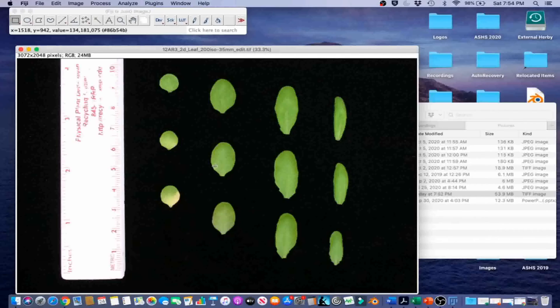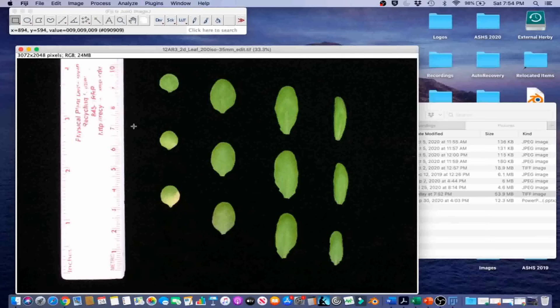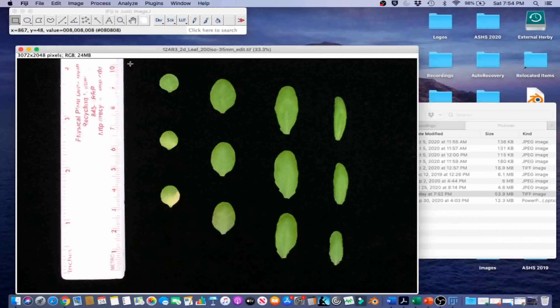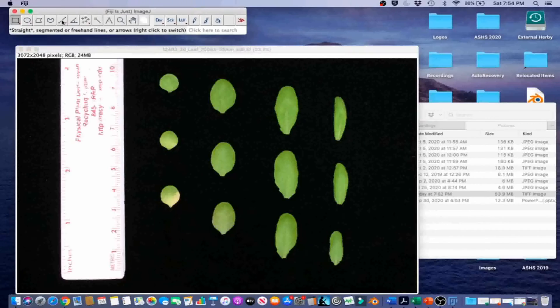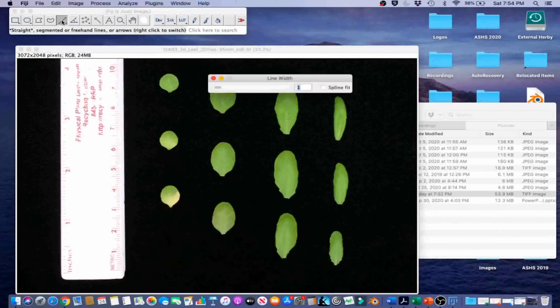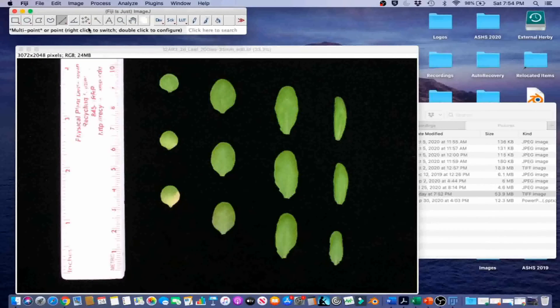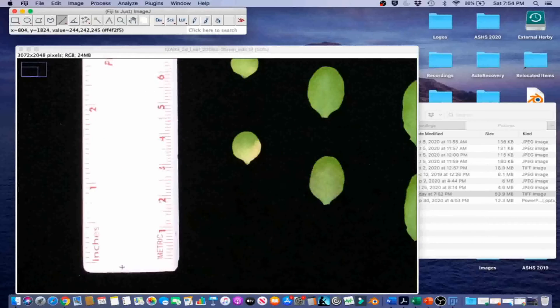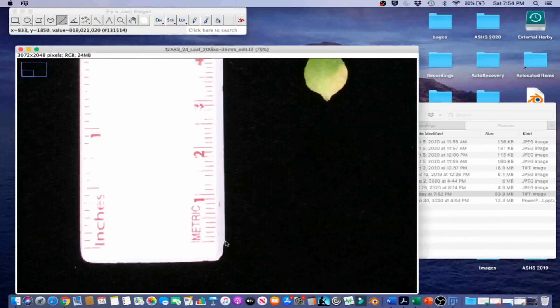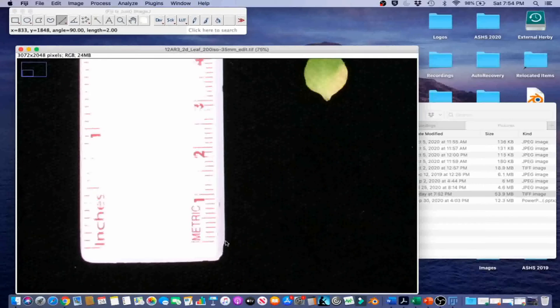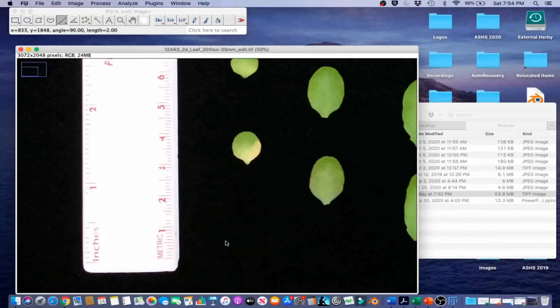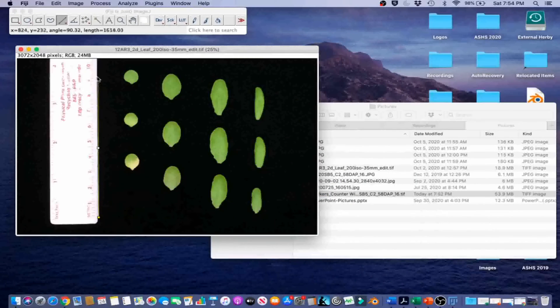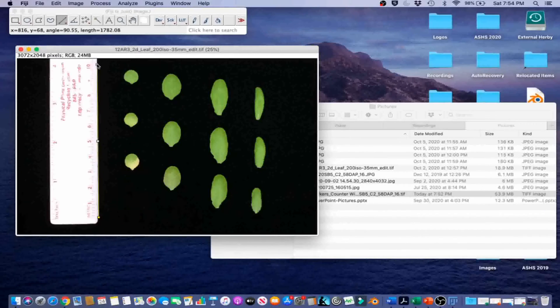We begin processing this image by setting scale. For accurate image calibration, we need a large reference object of known size near the object of interest. The ruler in this image matches that description. Go ahead and select the Straight Line tool. We're going to draw a line along the length of the ruler. I got it selected. And then we're going to zoom out again. I'm going to put it up to the 10 mark in this case.